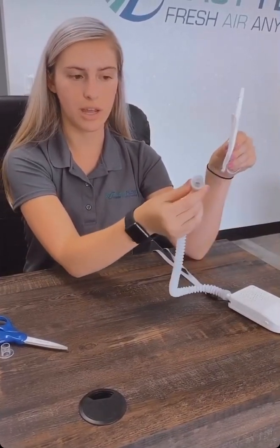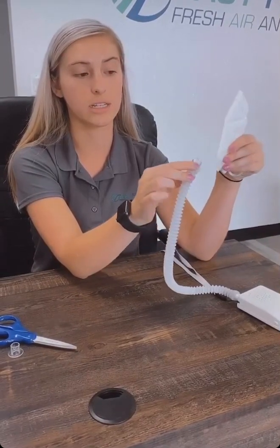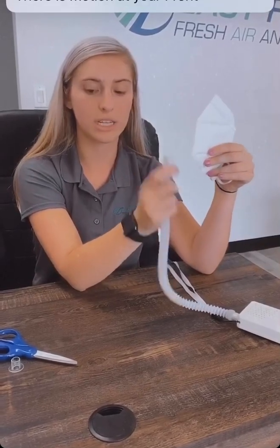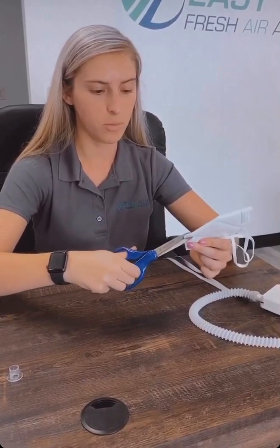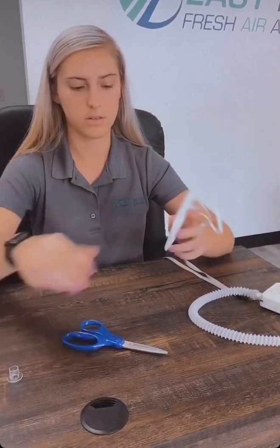And then you look at the hose. How big of a hole do I need to cut for this? We always suggest cutting smaller than bigger. So then you can wedge in the hose and create a really tight seal with this plastic connector piece. So first, I'm just going to take a scissors where I want it, right here, and cut a small hole. Then I can see once I open it up if I need to make it bigger or if I'm able to wedge in the hose.